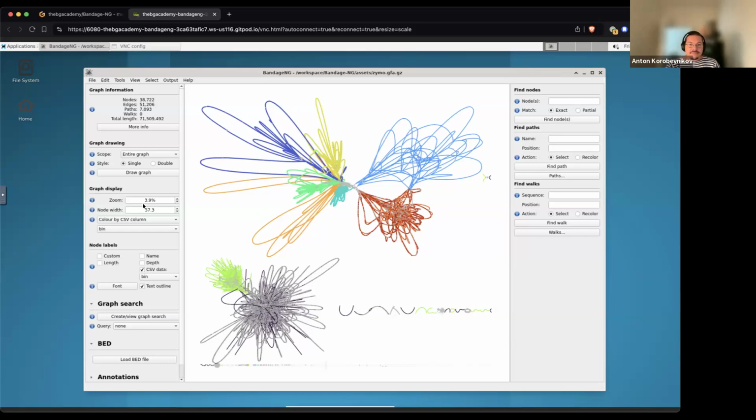So you can see that there are multiple bins, and some of those bins look similar in terms of the difference in GC content. Let me just reduce some clutter. Meaning that we're pretty good, but at least in the genome part we definitely see some mixed things.